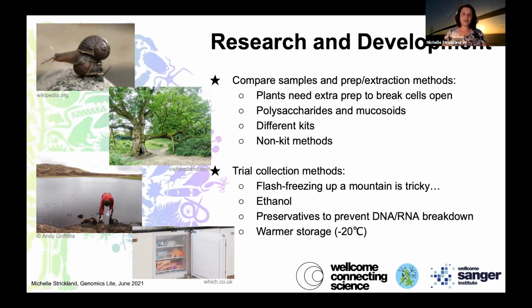Yeah, that's always a risk. One of the reasons why we're using things like the cryoprep, things like the grinding and lysis buffer, the more we can automate it, the more accurately we can control those processes. We found that if we do smash something too many times, we do end up fracturing the DNA, or we might not break the DNA initially, but we might just nick it, just break it just enough that it looks good. But then when it goes further down the line, it just falls apart, it degrades. We don't have anything useful at the end of it. So yeah, that is again a very tricky part.